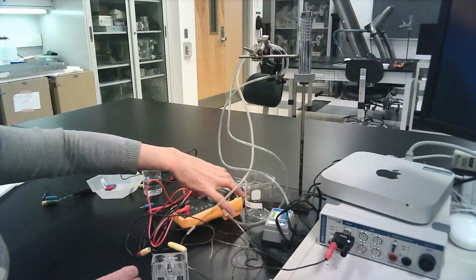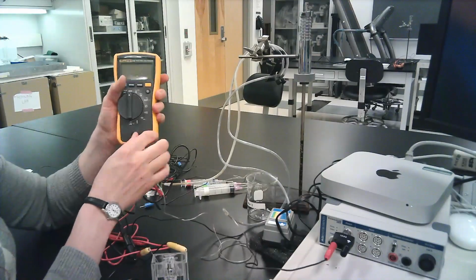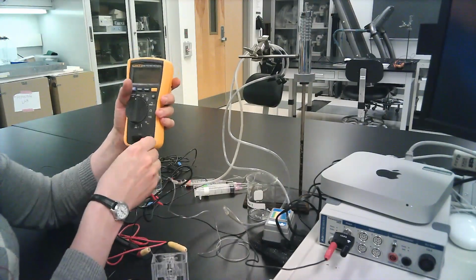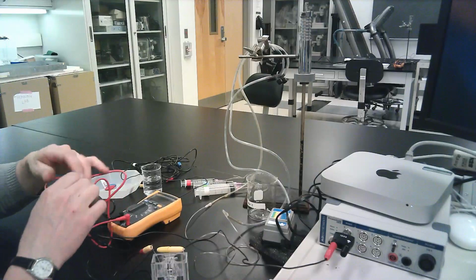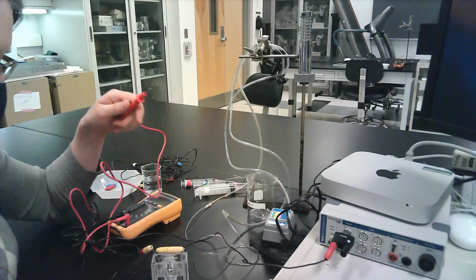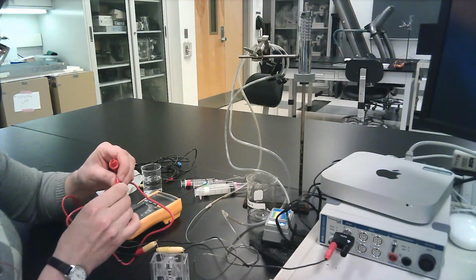So here is my multimeter, and in this case we'll connect that red alligator clip to the positive terminal on the multimeter. There's a couple different ways you can make that connection. In this case, what I'm going to do is I'll just take the red tip of this multimeter and we'll make physical contact between these.